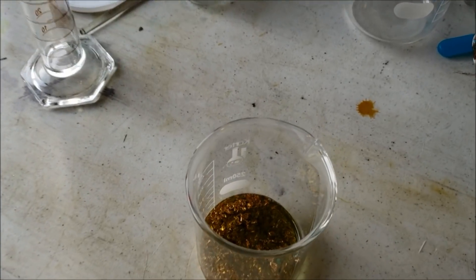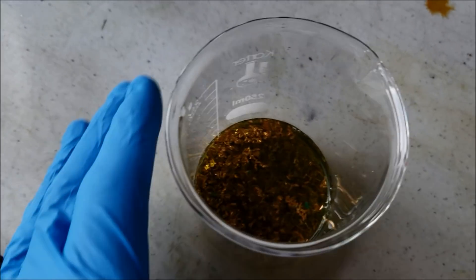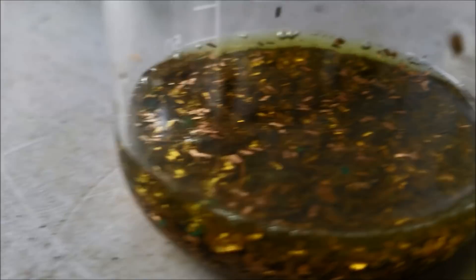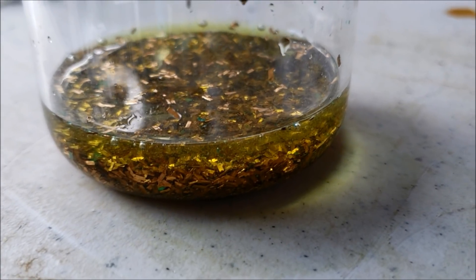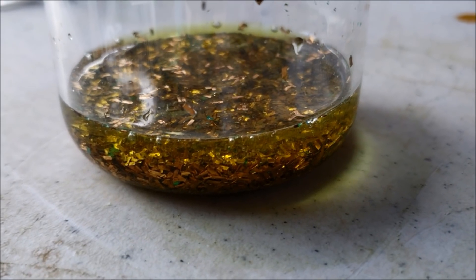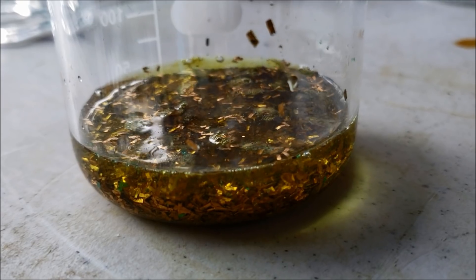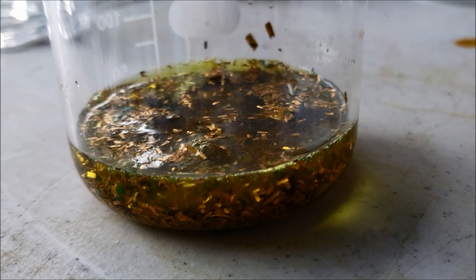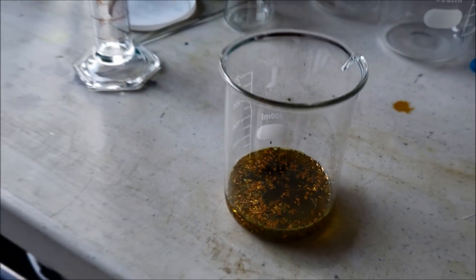There's your aqua regia. You can kind of see it starting to turn a little bit yellow because it's eating gold. If you warm it up a little bit it helps, but it's not necessary. See it bubbling? It's eating gold.